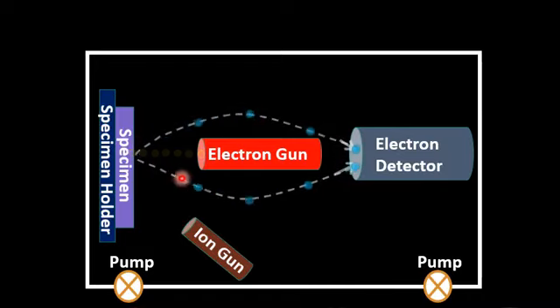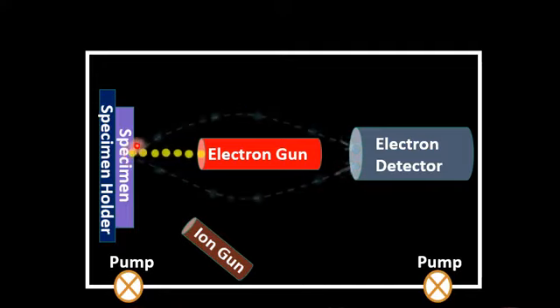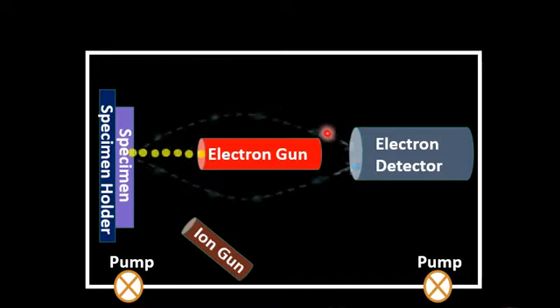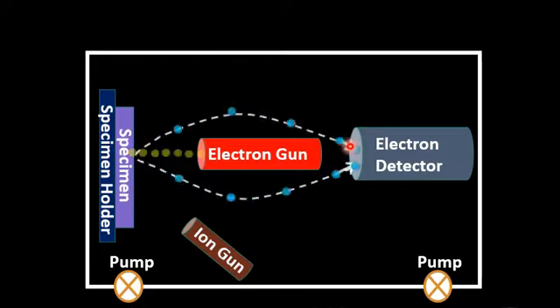So, the energetic beam of electrons incident on a sample surface emits the Auger electrons from the sample surface, and the emitted electrons are transferred onto the electron detector, or Auger electron detector. On the basis of that, we have an idea of the sample composition, and an idea about the presence of different elements in the Auger electron spectroscope.